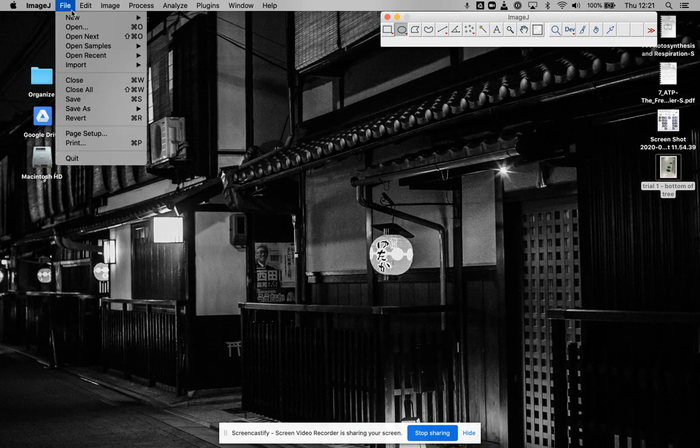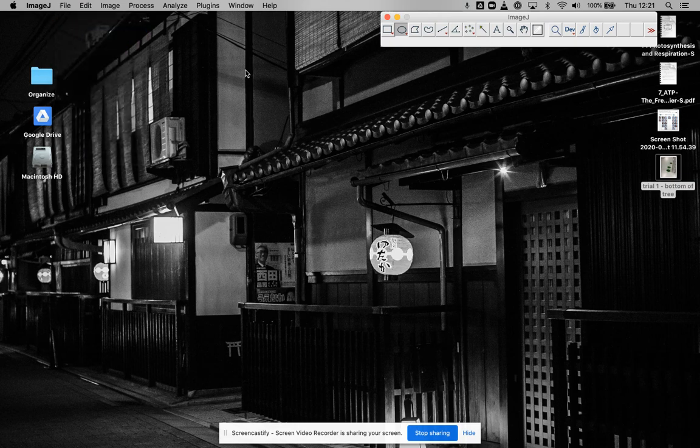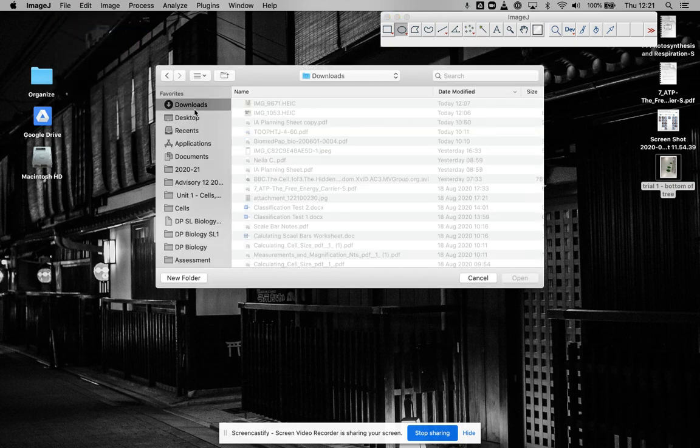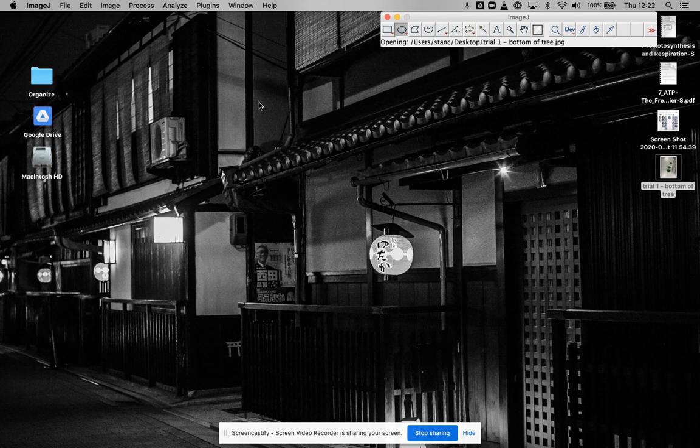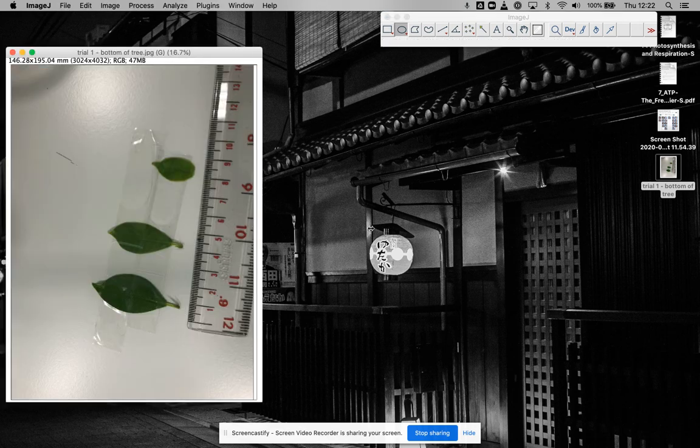With ImageJ, the first thing you want to do is open that image we took. I'm going to go to the desktop, open up this one. Make sure it says ImageJ up here—it's easy to get confused. This is the picture I took.